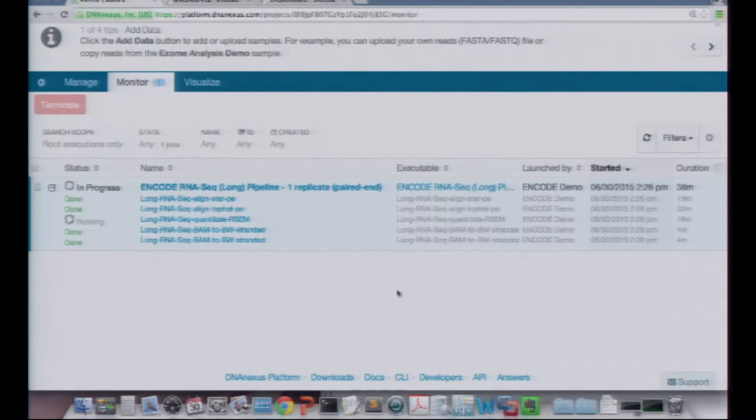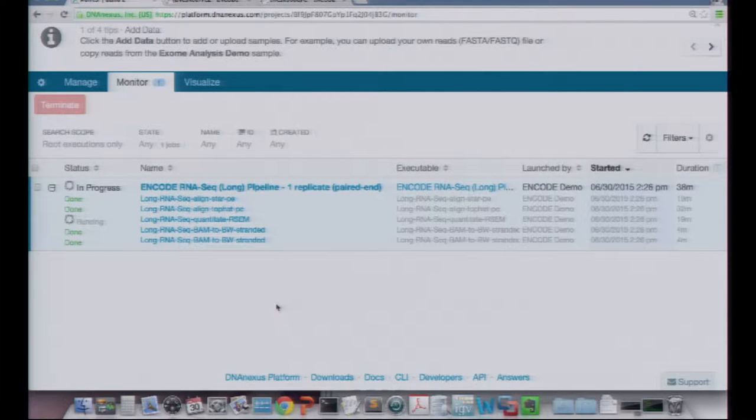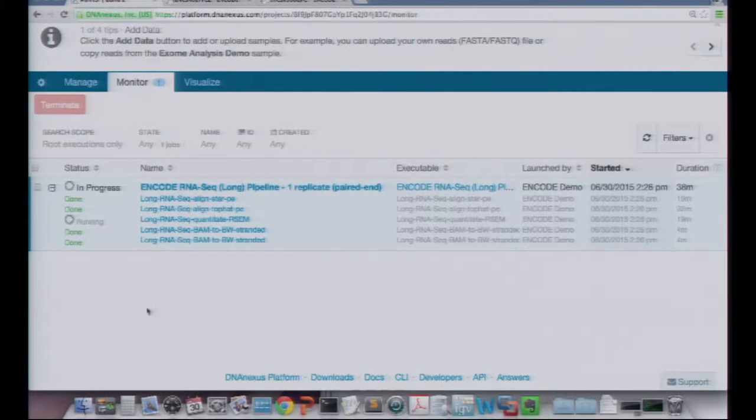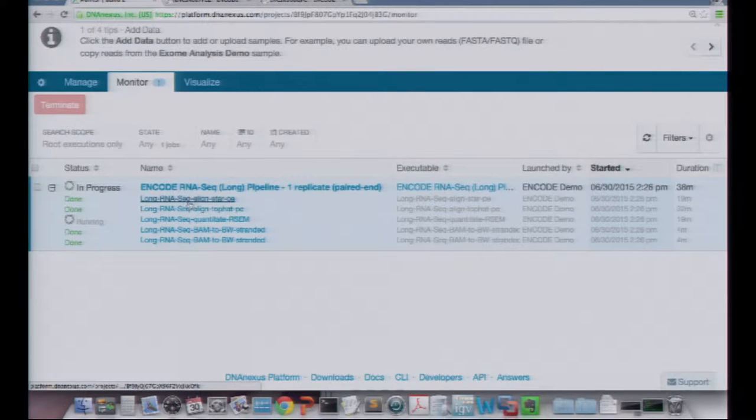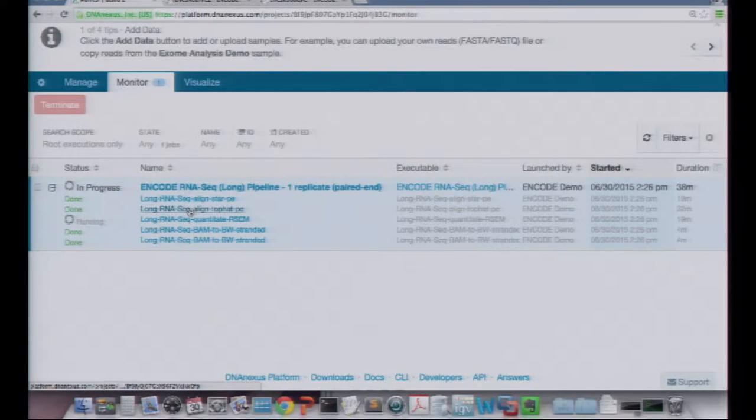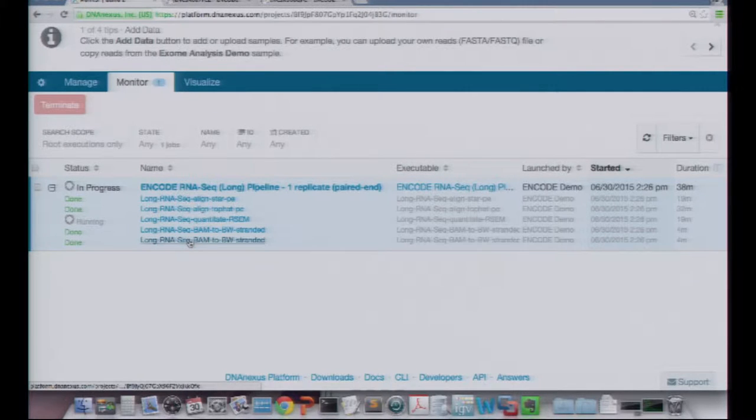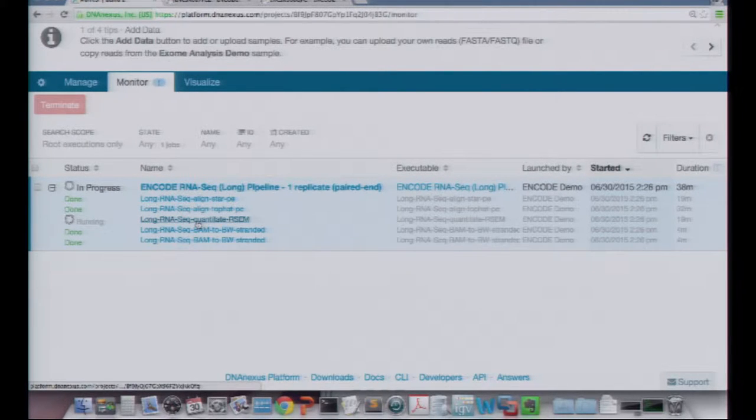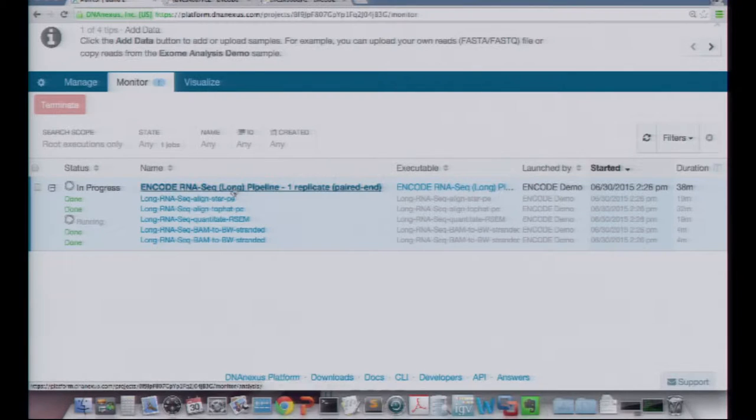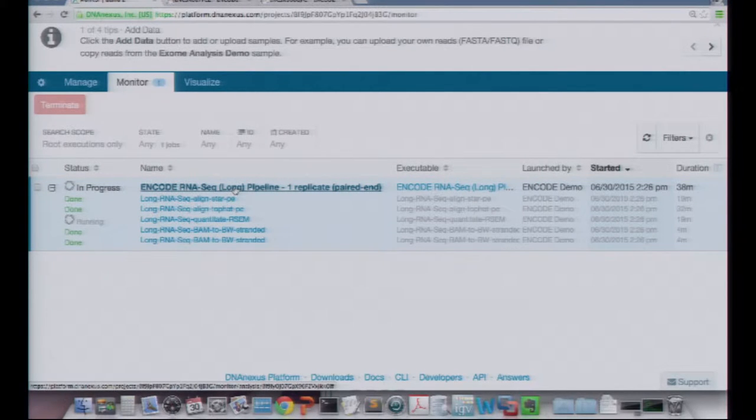So if you got your job started when mine does, or within a few minutes of it, you can see that the two alignment jobs are done and the two BAM to bigwig jobs are done. But the quantitation from RSEM is not done yet. Maybe yours is done, if you got it done the first time.